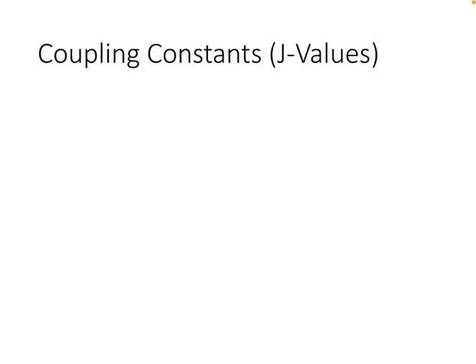Hi everyone. In this video we're going to talk about coupling constants, and then we'll also talk about chemical shift. So where do peaks show up on an NMR spectrum and what influences their location? Last time we talked about spin-spin coupling and how neighboring protons can split each other, so you can end up with doublets, triplets, quartets, etc. But let's talk about the distance between those peaks.